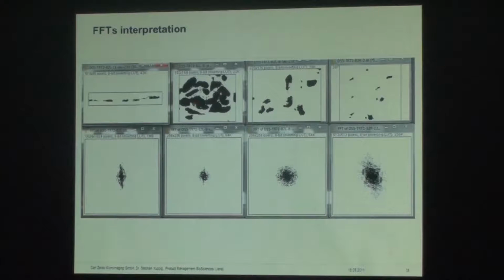So you take the FFT of it, you have the magnitude and the phase. You're only showing us the magnitude, but the phase contains all of the information about where the objects are. Yes, sir. But in this case, this is only used as a quick and rough example to show the pattern, not distinguishing the phase and the amplitude. I would definitely think about doing that.